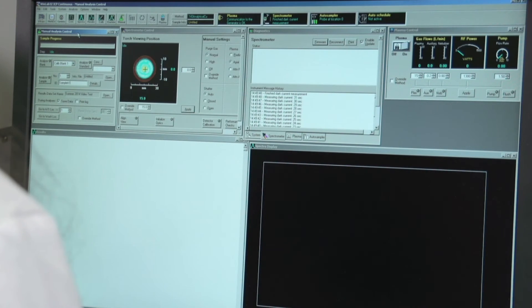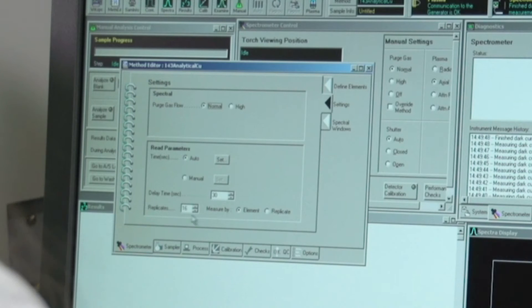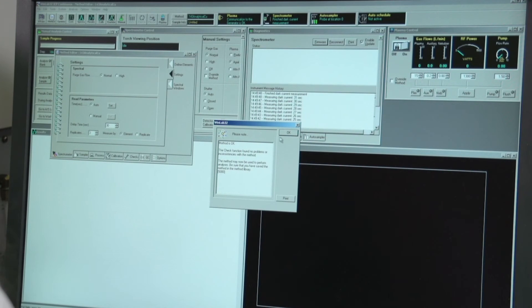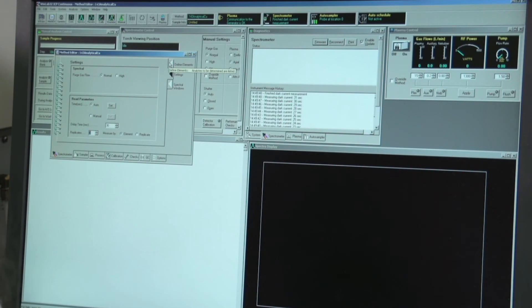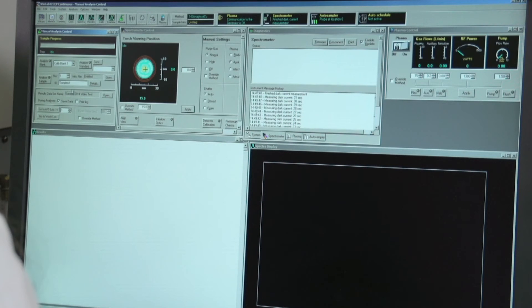Once you have collected 16 replicates of the blank at the one wavelength, go back into the method editor settings and change the replicates down to 3. You will use 3 replicates for all remaining copper and unknown brass solutions. Confirm that element is checked, the delay time is 30 seconds, do a check method, and save the method. Then have your partner insert the line into the copper sample and hit analyze sample.